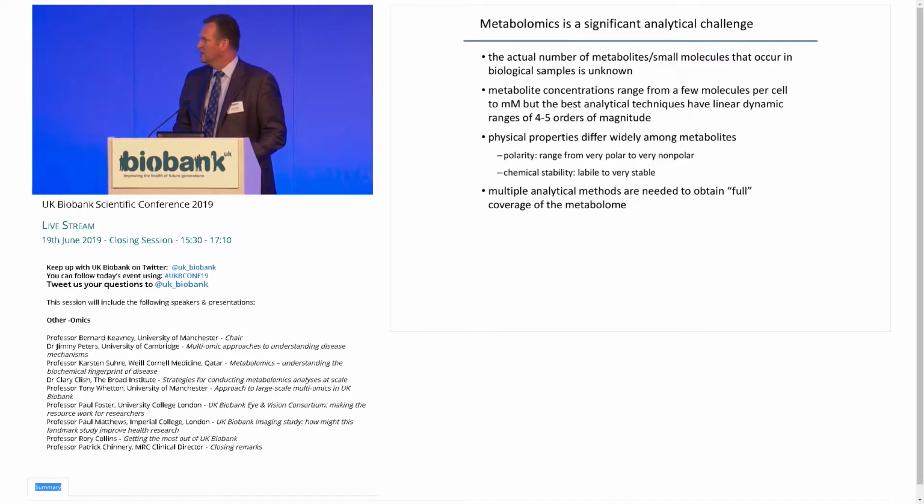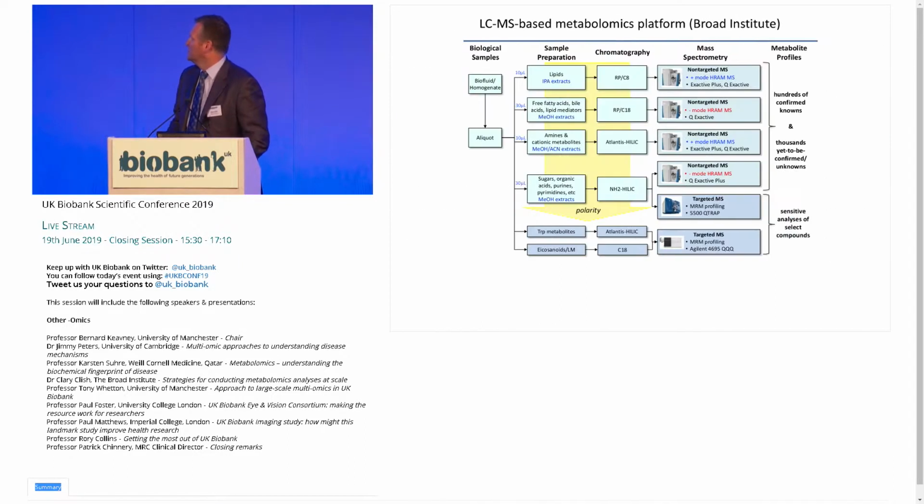of the metabolome. The other point I would add here is that unlike genomics, where you might be looking at qualitative information, the presence or absence of variation in a gene, in the case of metabolomics, the metabolites are present in most people, and what we're trying to measure are differences in the levels. So we have to have very precise methods.